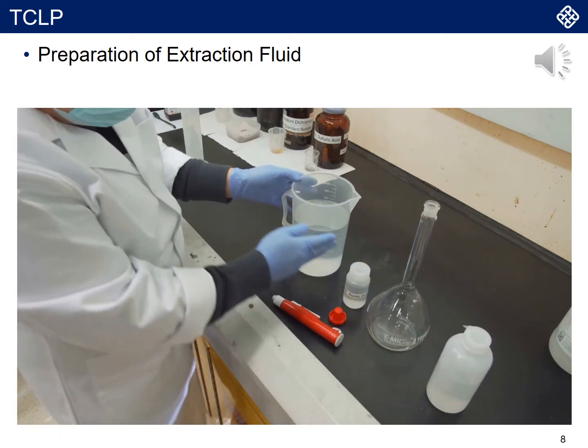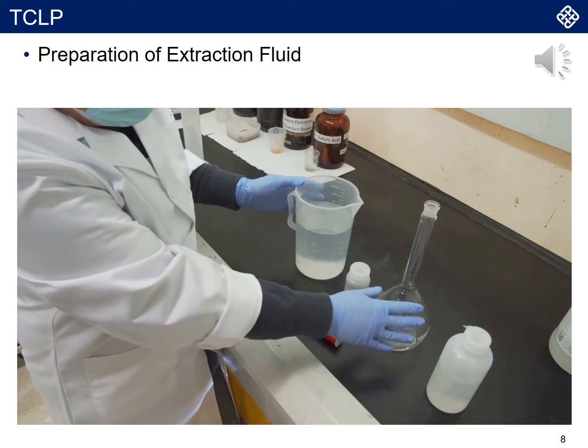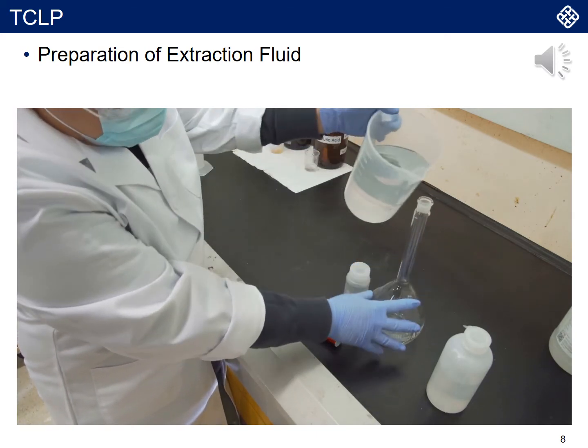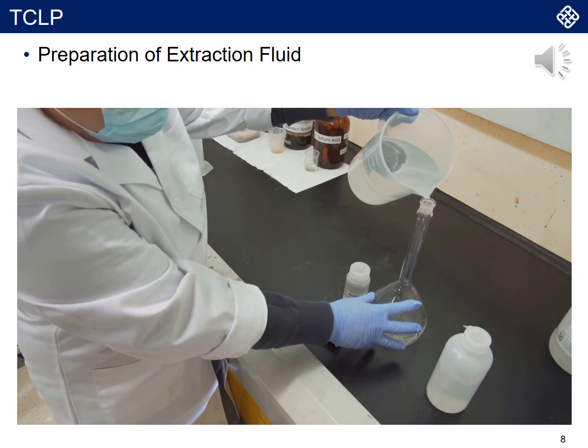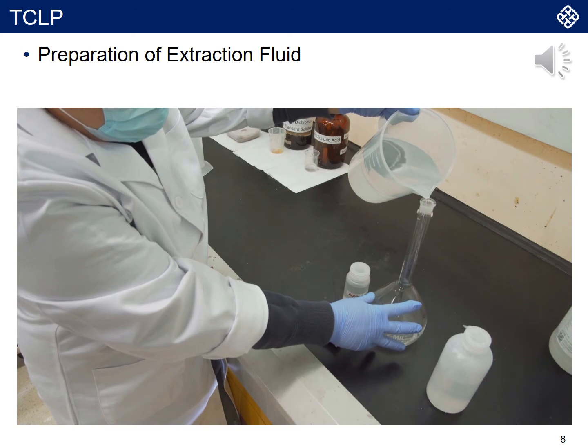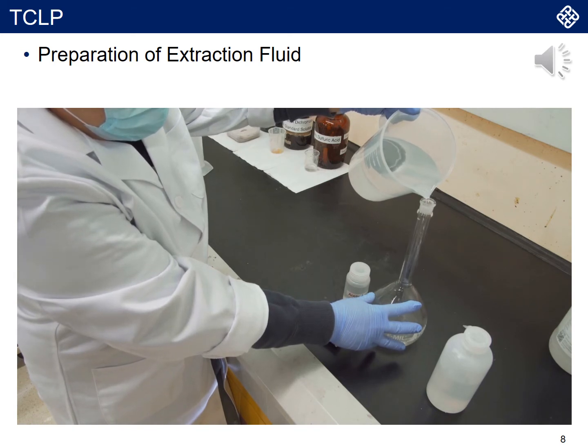After that, you can put distilled water in it for dilution. Basically what you need to do is gradually put everything in.